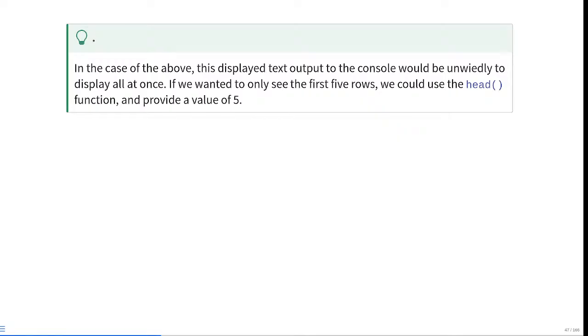So in this case, we have 100 rows, and as we saw with my attempt at the interactive image a little bit earlier, it's going to quickly overwhelm what we have as far as screen space. So it's oftentimes good, if you're working with a matrix or a similar object, which is known as a data frame, to subset what you're actually displaying within your console window at any point in time, so it doesn't get too overwhelming and you lose track of what code you have actually run.